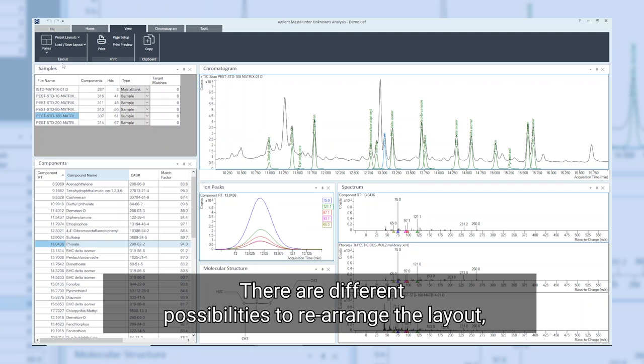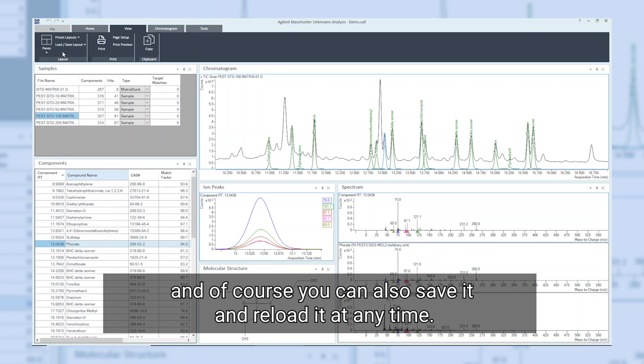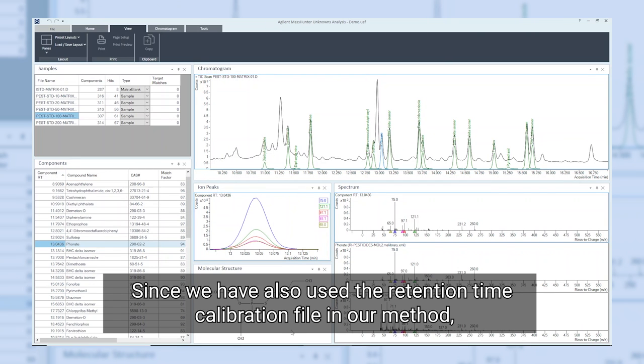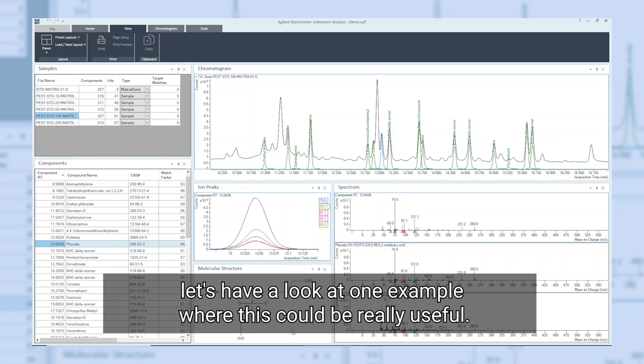There are different possibilities to rearrange the layout, and of course you can also save it and reload it at any time. Since we have also used the retention time calibration file in our method, let's have a look at one example where this could be really useful.